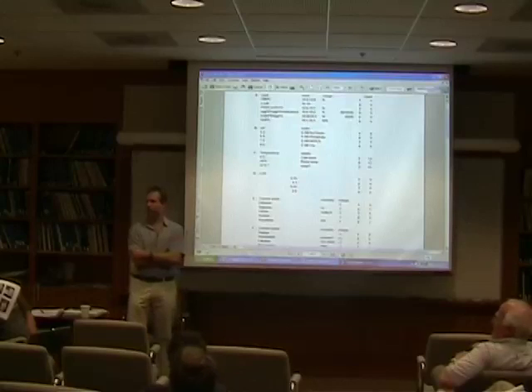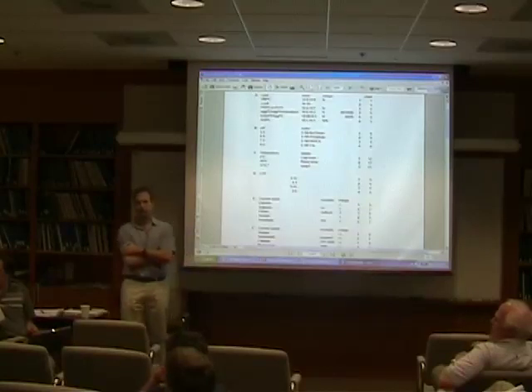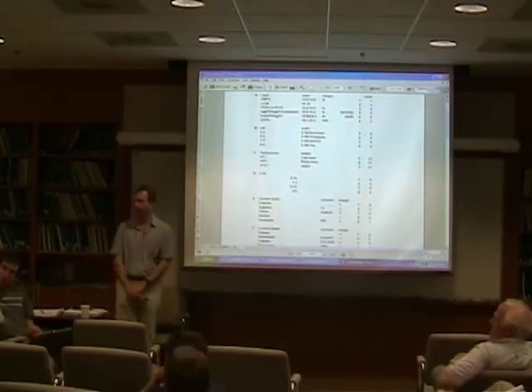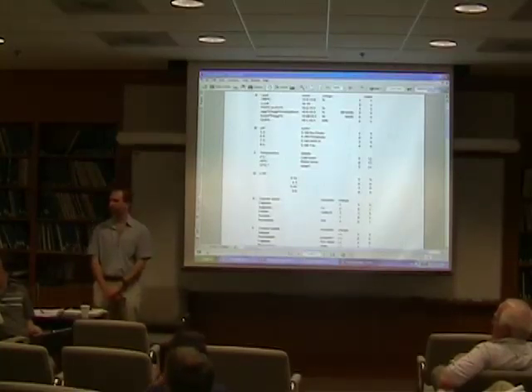But the situation, in my opinion, changes the moment you bring lipid into it. The lipid actually keeps the protein quite happy. And then you can actually play around again with the buffer conditions and try to get the protein out of the membrane. So I think the buffer is an important one. Okay. And I was thinking about the presence of OTG. I agree. Now, what about the OTG story?